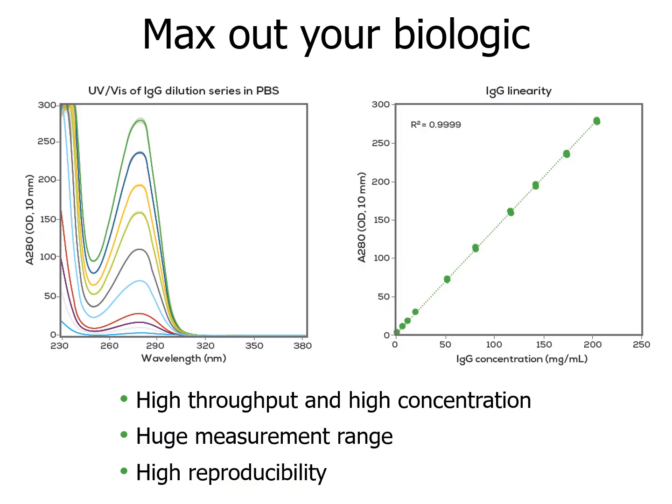On the left, we can see absorbance spectra with different concentrations of purified IgG with the telltale absorbance peak at 280 nanometers. This is a dilution series where each replicate is being run with an n equals 8, and we're graphing all of those lines here in this graph on the left. You notice that they all overlay each other very precisely.